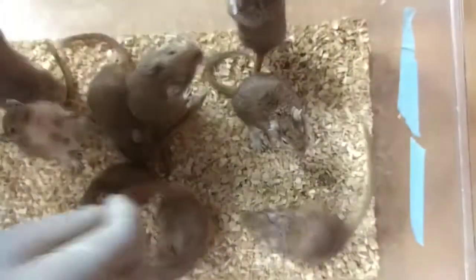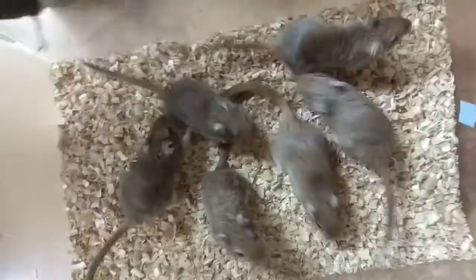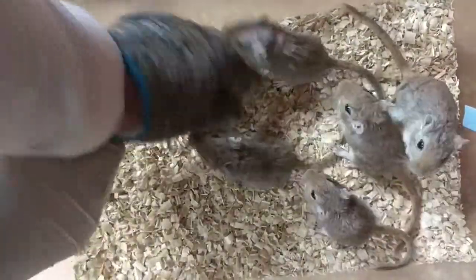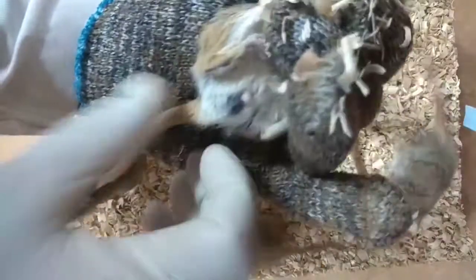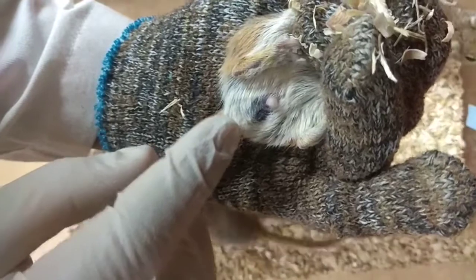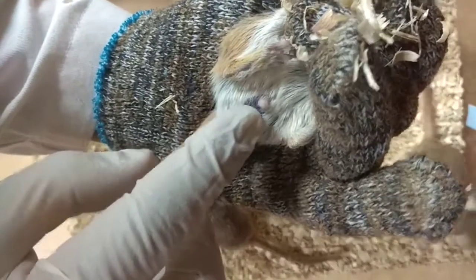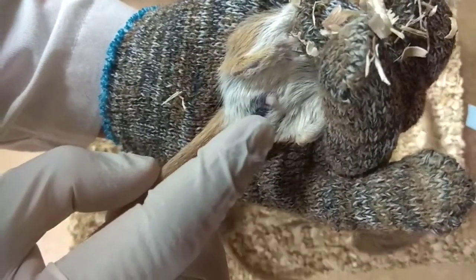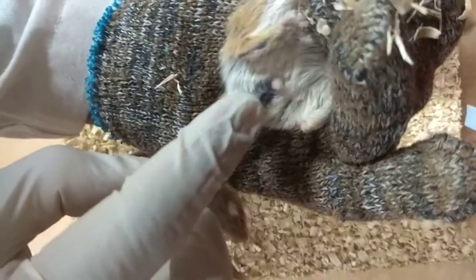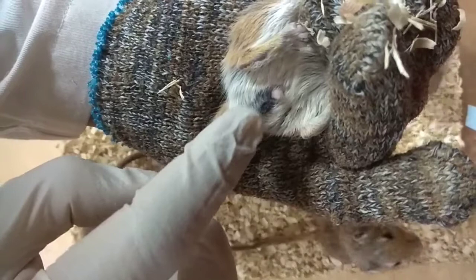And in the case of female gerbil, if we check, the space between the vagina and anus is very short. This is the anus and this projected portion is the vagina. So the space between anus and vagina is very, very small.